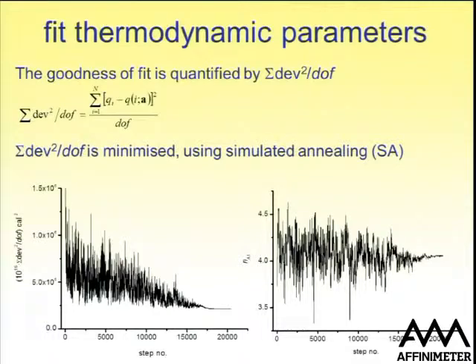If a fit becomes worse, we will still accept it with a certain random statistical chance that this step is going to be accepted. So not all the steps in our optimization method always lead to a better fit. We allow the fit to become worse from time to time, but that happens with a certain Boltzmann factor. We then have a kind of virtual temperature which decreases, so steps going up become increasingly unlikely, until at the end we freeze everything and we have the best possible fit.